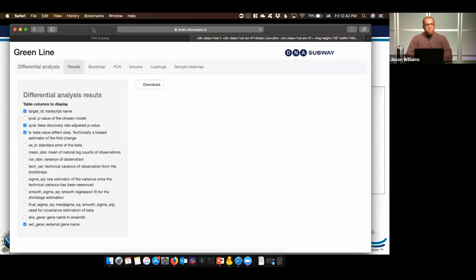This is a technology using the R language called R-Shiny. So if you've ever seen some sort of interactive infographic, perhaps on a website where you can make adjustments, this is what that application gives you the ability to do. And the good thing about it is that if you are using something a little bit more sophisticated with your students, maybe you're teaching them R, you want to think about data science, you can actually go ahead and use these results and explore them in R yourself.